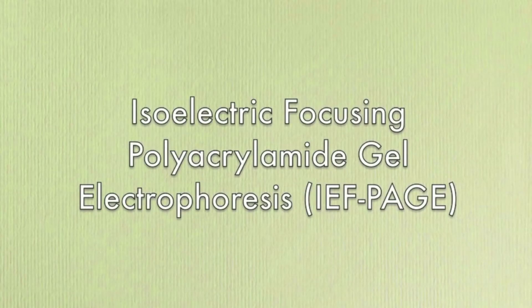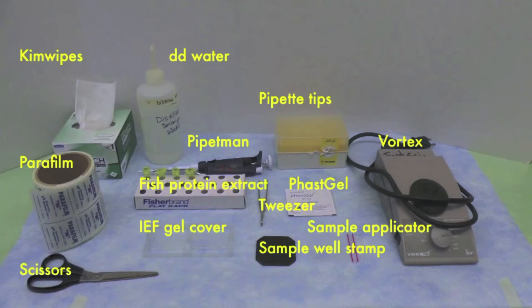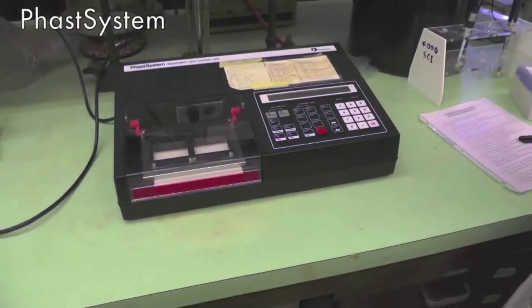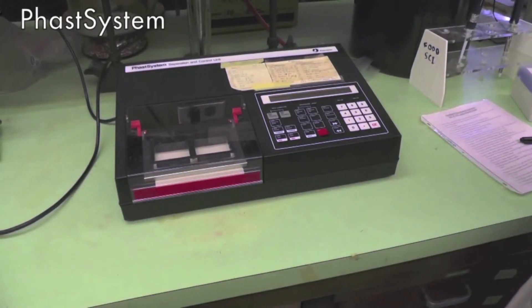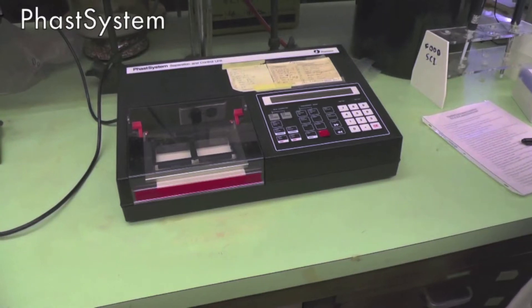IEF PAGE stands for Isoelectric Focusing Polyacrylamide Gel Electrophoresis. Here is the equipment you will need. This is the FAST system that you will be using to run the electrophoresis.